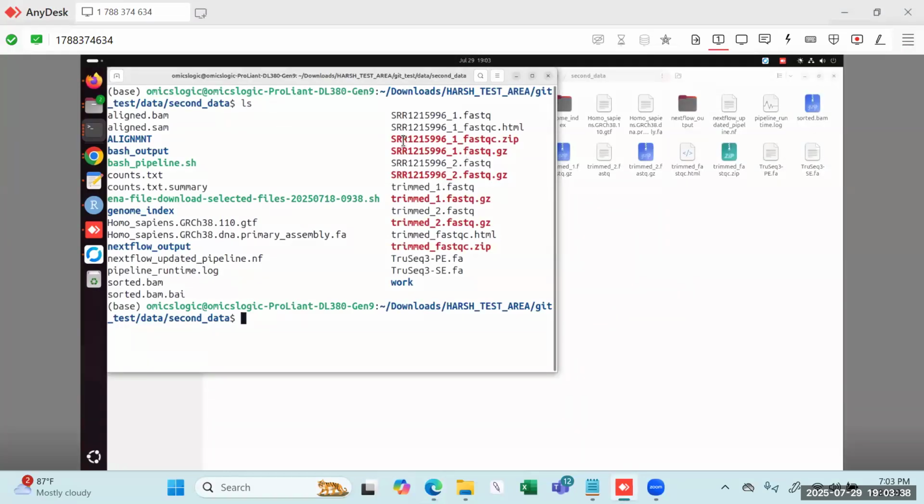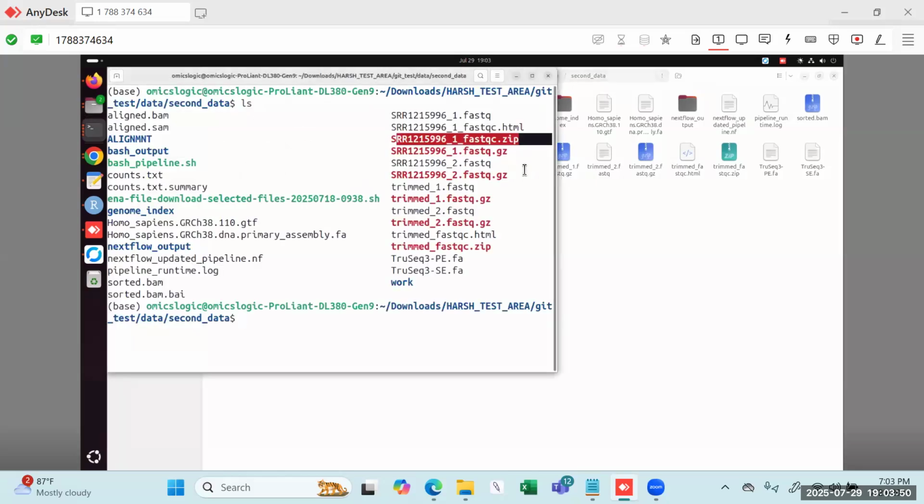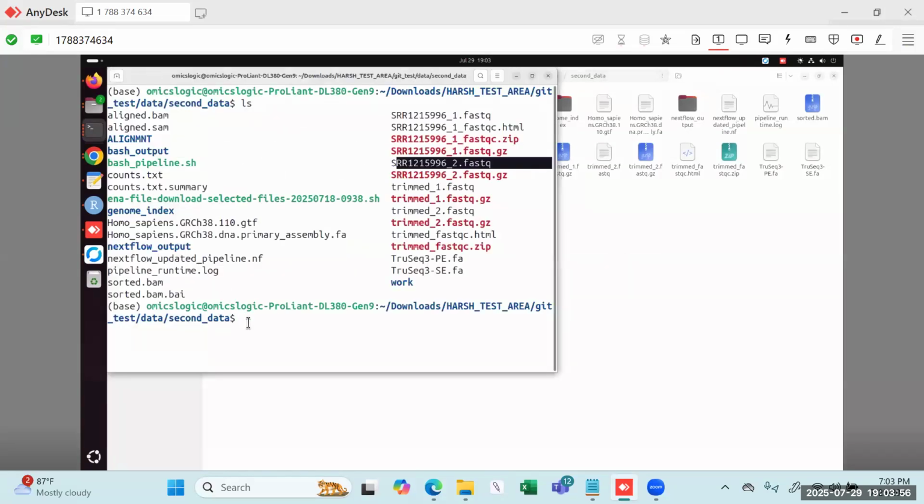When you fetch the files, it is going to be a zip file in your system. When you simply click on it, or apply the extraction command, your files will be extracted and will no longer be in zip form. You can see I have my FASTQ files here.